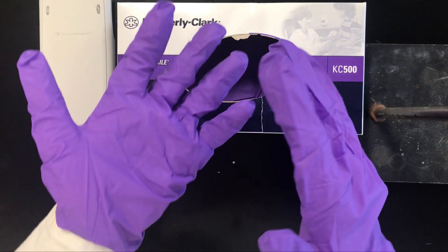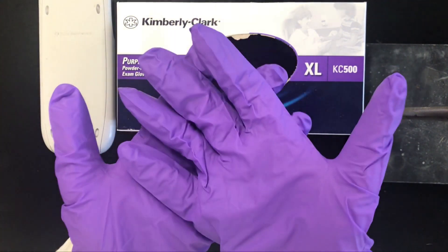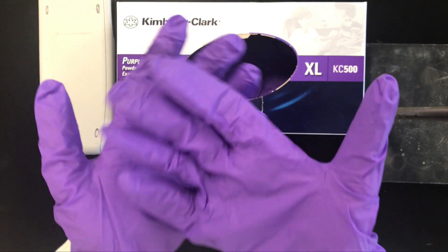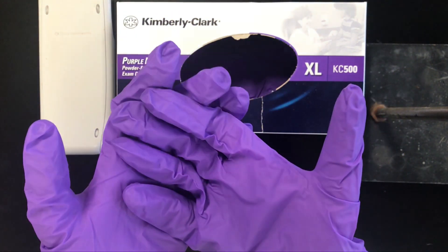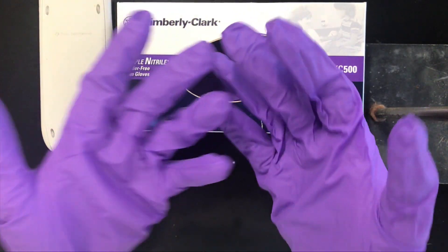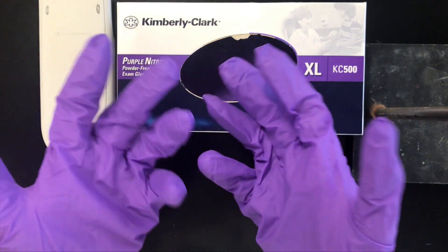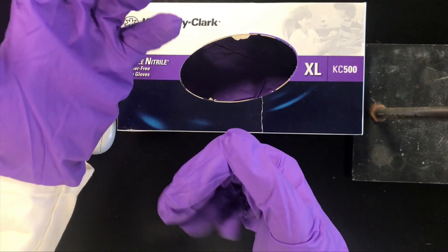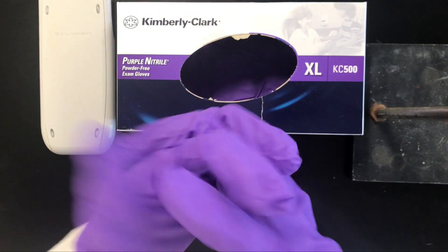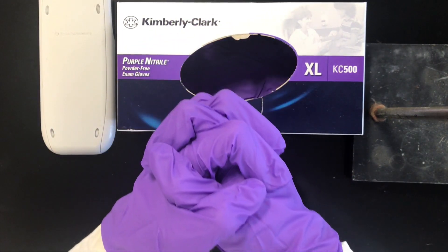The last thing I would say is to remember to consider the outside of the glove as an exposed surface. You don't want to do anything with these gloves on your hands that you wouldn't do with a bottle of reagent. For example, you don't want to scratch your face or your eyes when you have gloves on, because then you're transferring chemicals from a reagent bottle onto your face — and that's exactly what we're trying to avoid. When your hands are gloved, remember to keep them off exposed parts of your body.